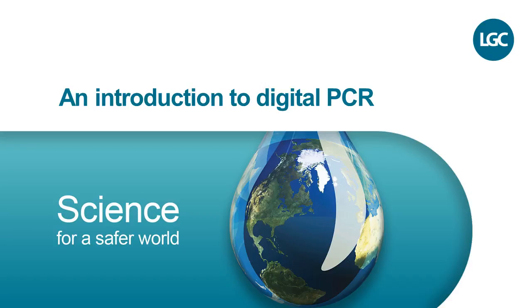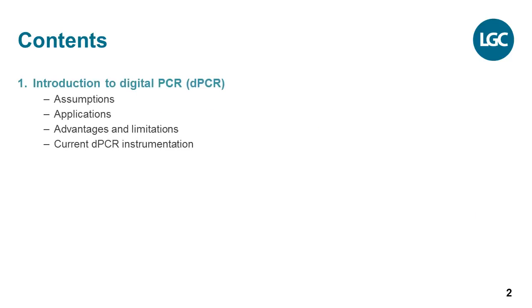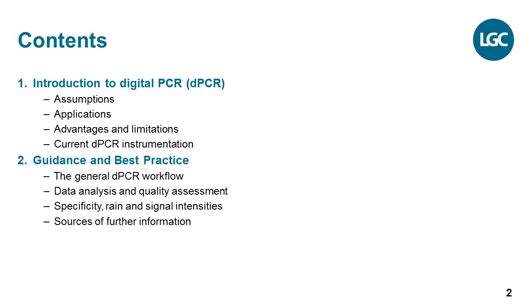Hello and welcome to this e-seminar which will provide an introduction to digital PCR. This e-seminar will introduce you to the digital PCR technique and provide recommendations, guidance and best practice for the application of the technique for routine testing purposes.